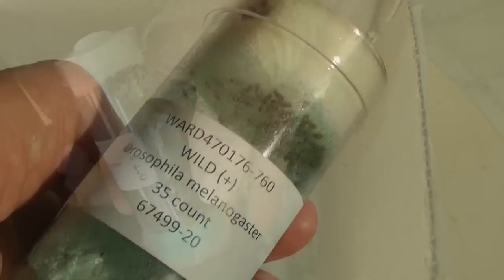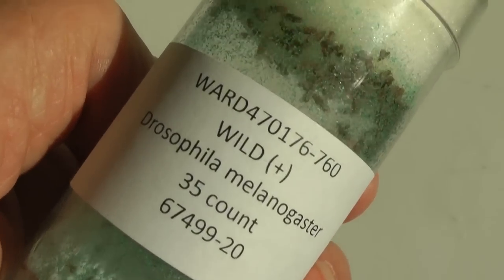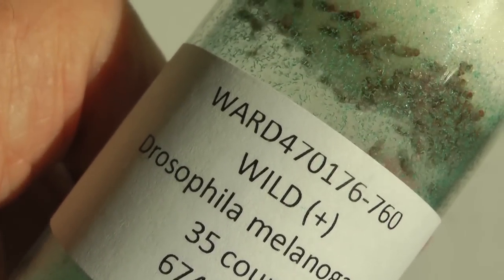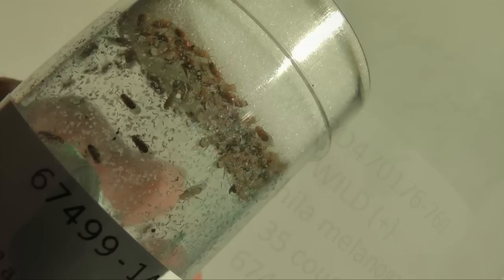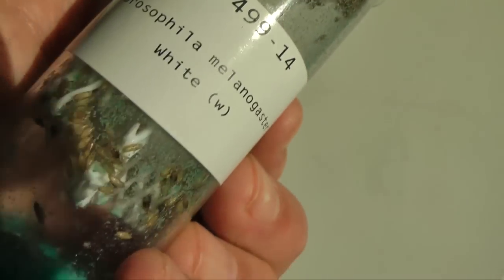These purchased red-eyed flies are called wild-type. They carry the gene for red eyes on both X chromosomes. The flies are packaged in vials with food and a mesh lattice.